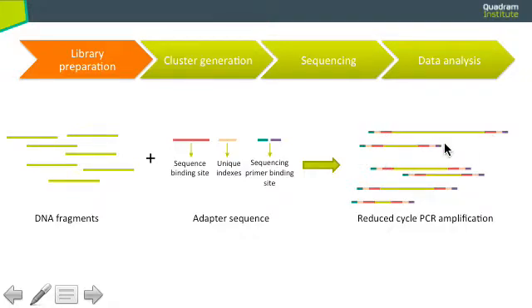And even if you've done the fragmentation using enzymatic methods or a sonicator, do you notice that some of the fragments are long and some short? So there is kind of a non-uniform way of the fragmentation itself.